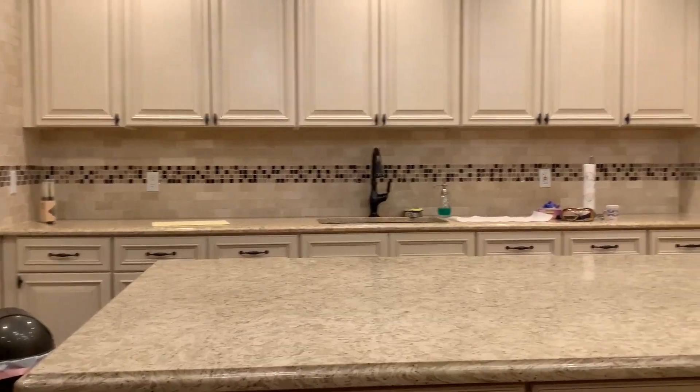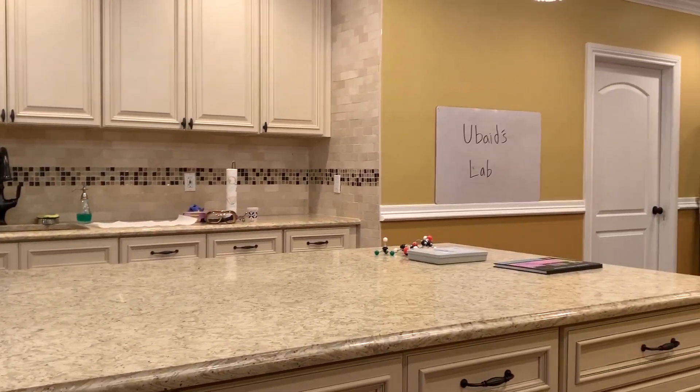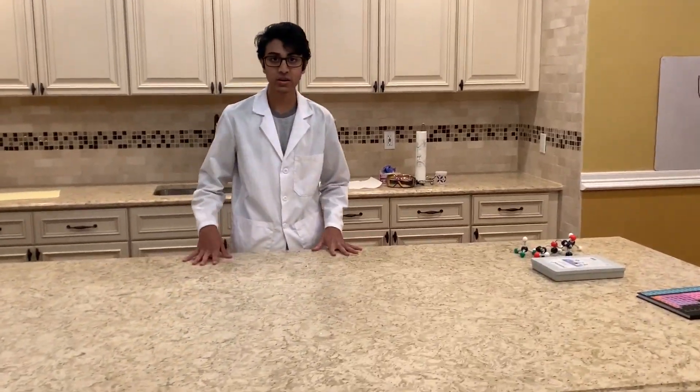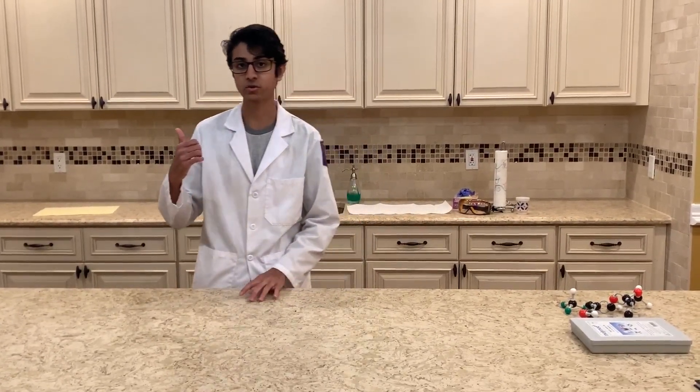For my lab, I'm using an unused kitchen area in my basement. In this general area, I usually set up solutions. I don't usually run reactions or syntheses here, since there's not that good ventilation in my basement. As you guys see, I do most of my stuff outside.